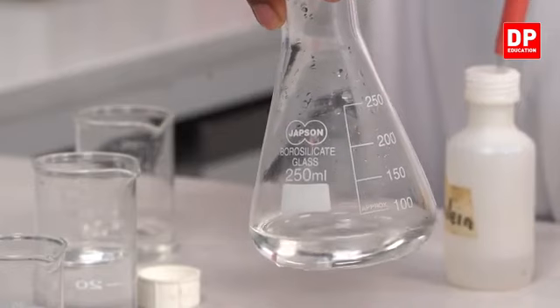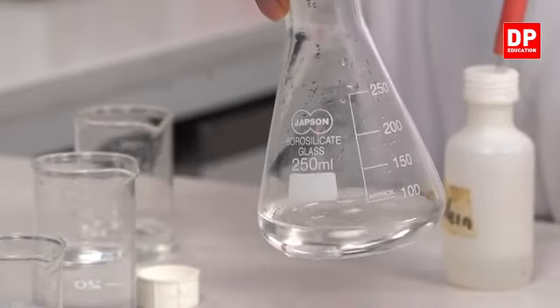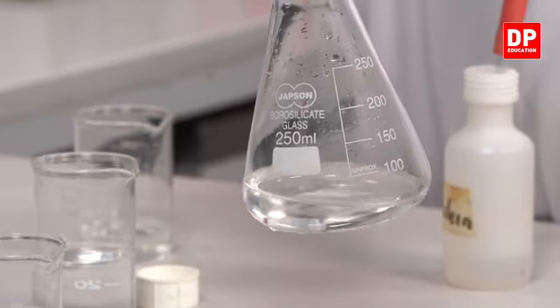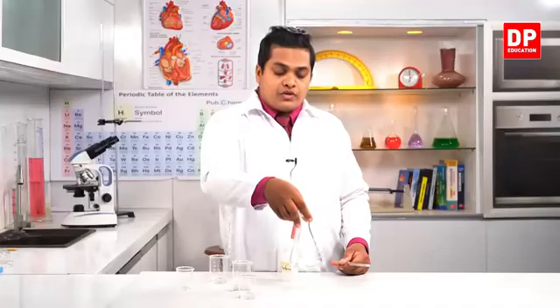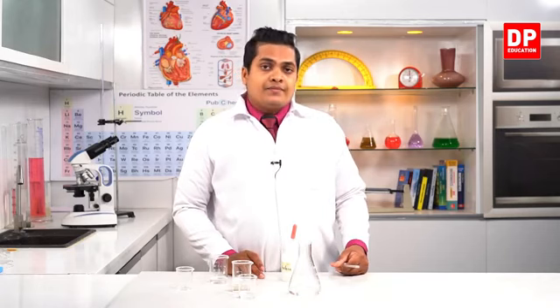It's because there are no acidic or basic features within this solution that I have in my hand right now. So we can finally conclude from this experiment that by adding acids to bases, we can neutralize or cancel off both acidic and basic features.